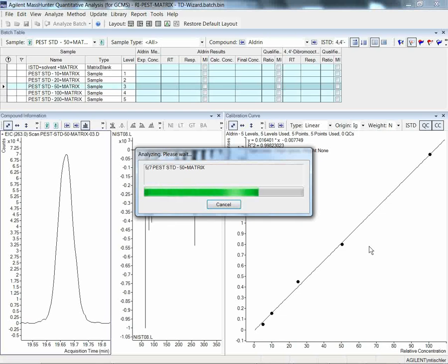And by cleaned up, what I mean is we saw that 44 background ion. That is not going to form a shape, and therefore you won't see that 44 in the deconvolved spectra. The deconvolved spectra, when matched up against a clean reference spectra, gives you a much better score, and you'll see that in a moment here.